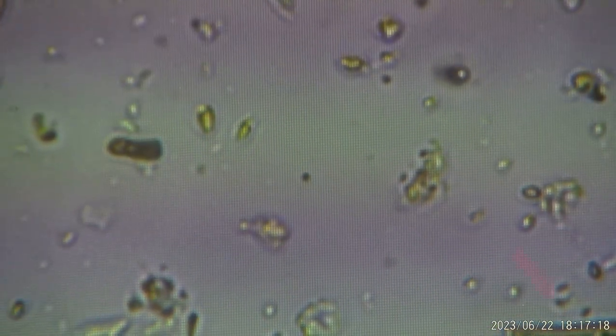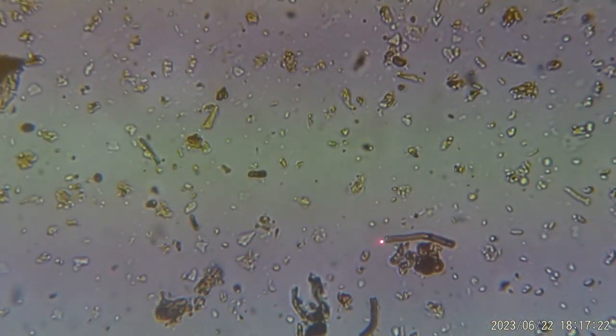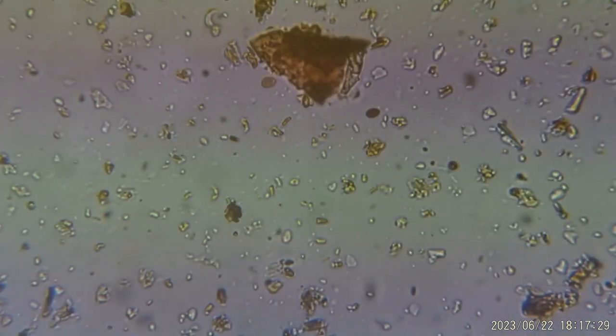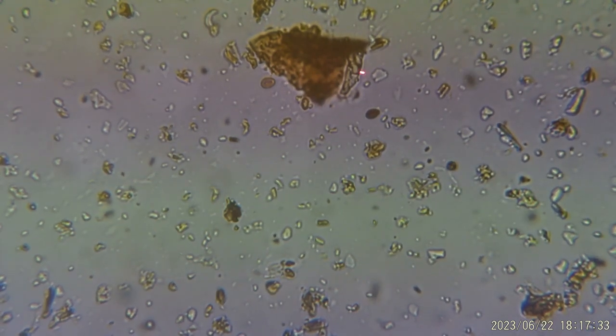So we are seeing more here and here. Again, this is great to see. Again, the aggregation that we're seeing here, another great sign that the soil is aggregating.